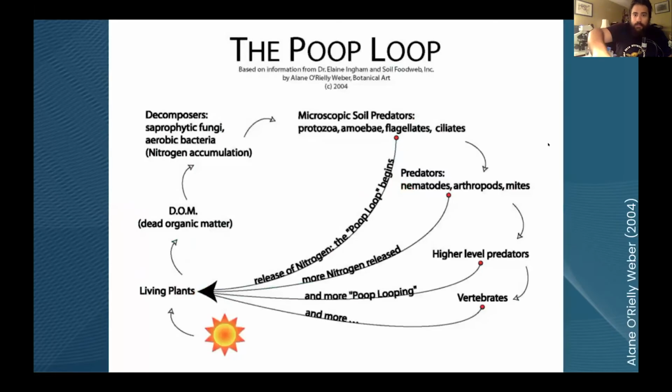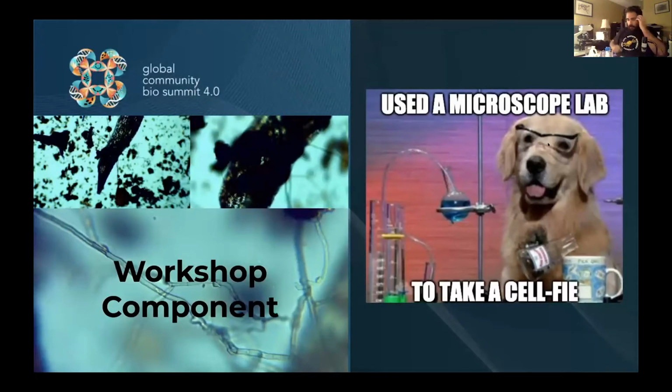And the poop loop. So we're going to break out into the actual workshop component of the session, which is good because we're about halfway through. I've got a little setup right here about all the stuff that you can do.